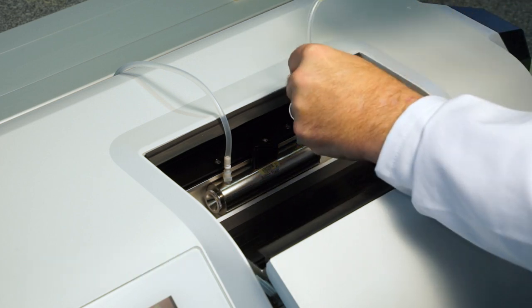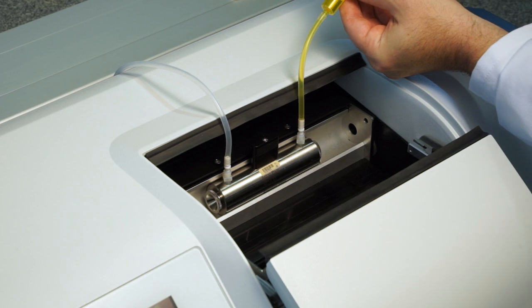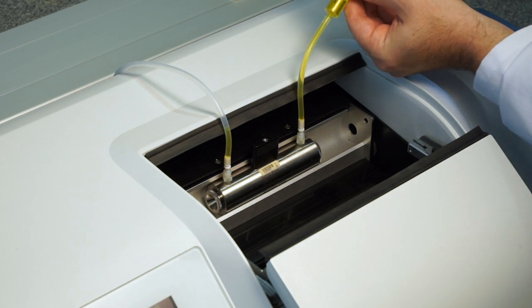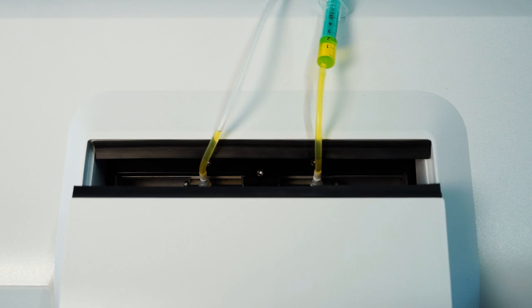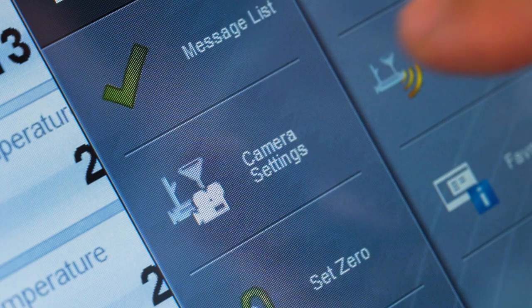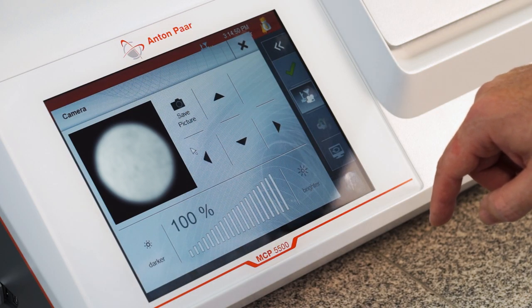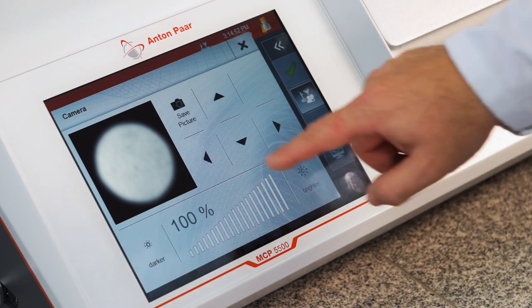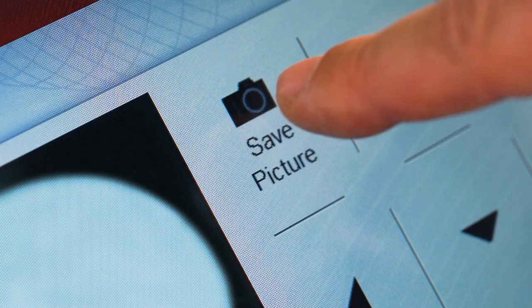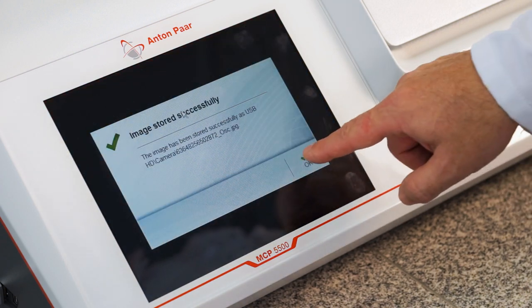The proper filling of the sample cell is essential to avoid measurement errors caused by bubbles or impurities. The MCP's filling check feature shows you a live image with the help of a built-in camera from the inside of the sample cell, and lets you double-check the correct filling of the sample or even save the picture for later reference, giving you traceable documentation of the measurement conditions.